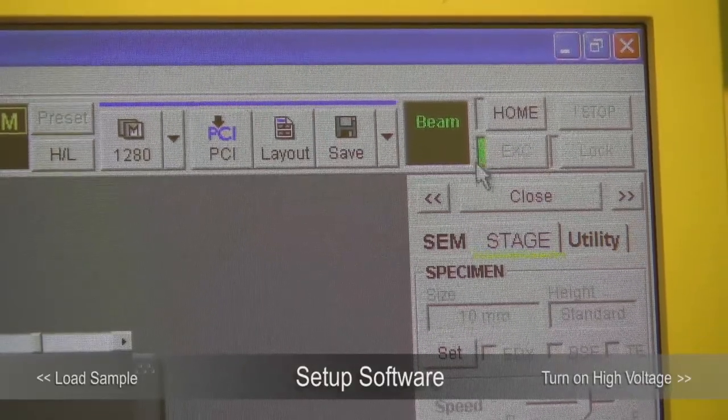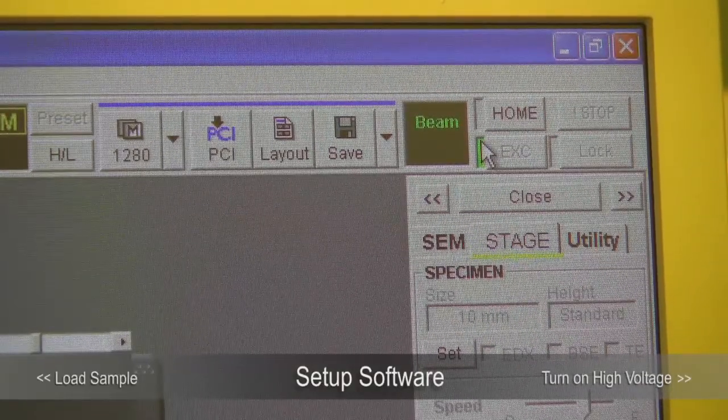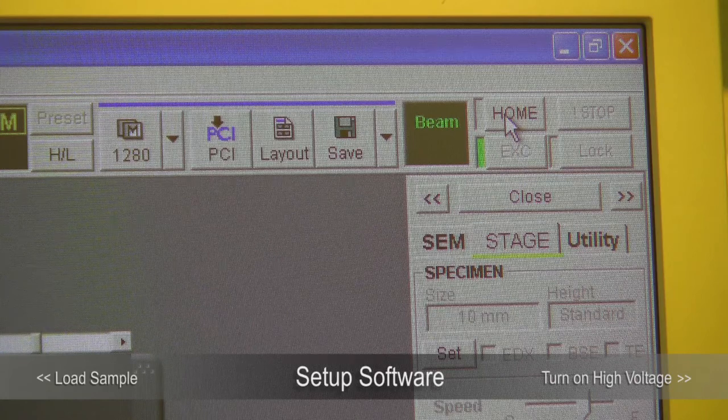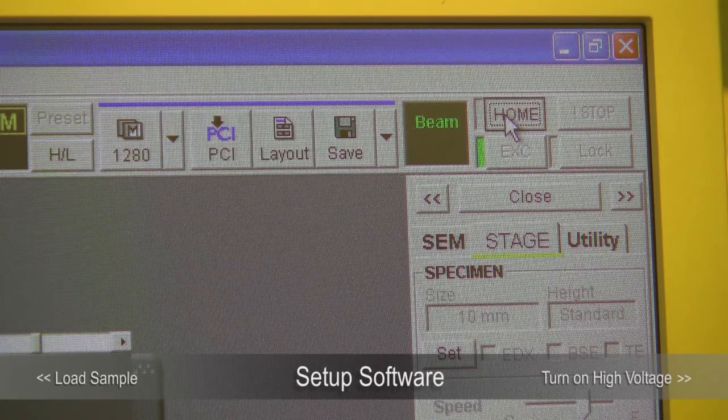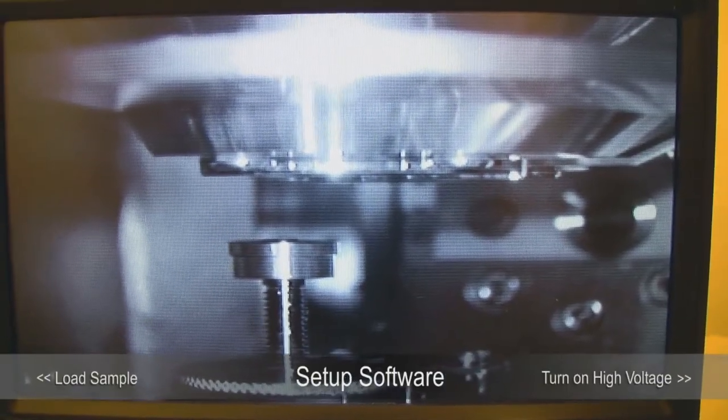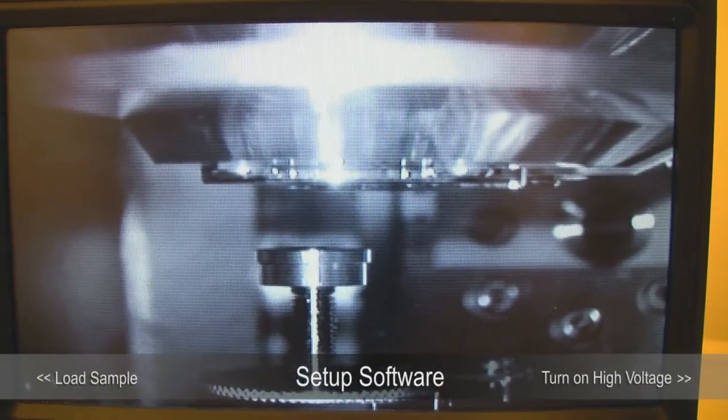We are still at the exchange position, as indicated by the green indicator — that's where we load and unload the sample. Home position is where the objective lens is. Click Home Position and you will see the stage moving, and your sample holder will be right below the objective lens.